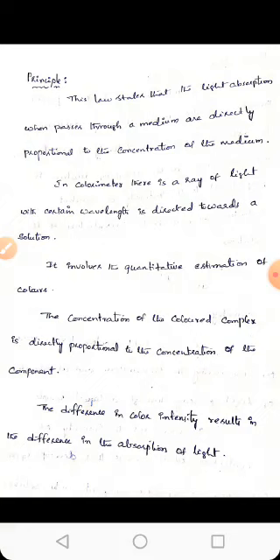That means it estimates the color present in the sample which we have taken. The concentration of the colored complex is directly proportional to the concentration of the component in the sample. The difference in color intensity results in the difference in the absorption of light. That means if the absorption of light is more, the color intensity is also more.